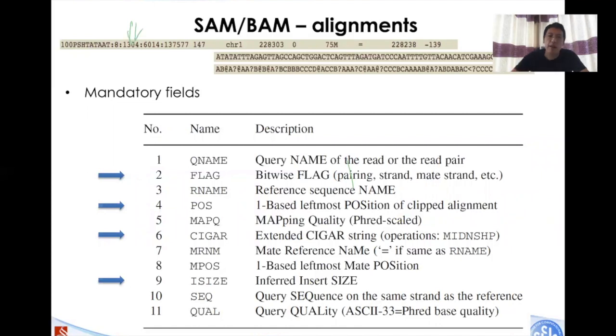It's this part. Now let's zoom into an individual line. In this particular line, which is one sequencing read, as you can see, let's dive into individual lines. And this is a zoomed-in version of one line here.